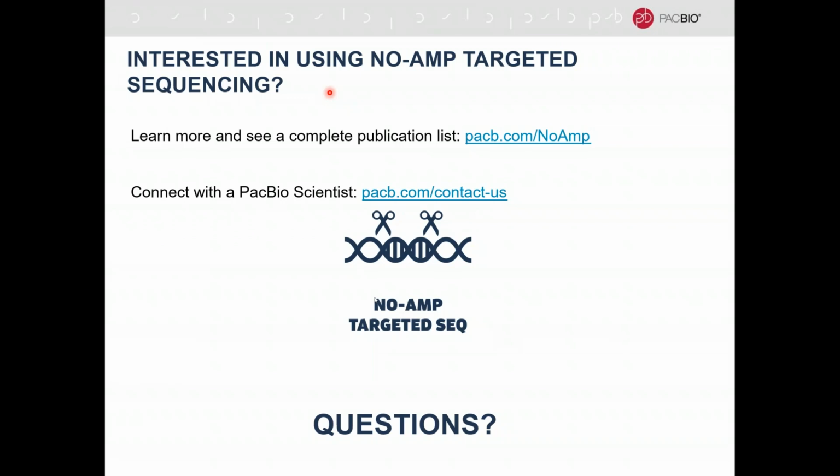Let's see. There's a question about whether we plan on developing a CRISPR RNA library. I would say it's on the same line. The second part of the question is how to guarantee the editing efficiency and off-target effects. At the current capabilities, for the guides that we've validated, the sequence is there, and we feel confident in those.